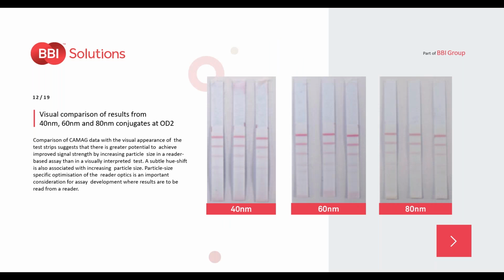Visually, we took some pictures of the strip focusing really on the 40, the 60 and the 80 nanometer. These aren't the best pictures in the world. It's really hard to capture this. But if you look at the 60, you can see that on the 4th line down, you can see a stronger signal strength than you can see on the 40 and on the 80 nanometer.